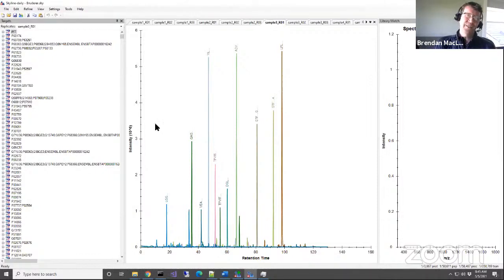And we got all the way through all the processing. We did a workflow that somebody might do with OpenSwath or some other tool that's not as visual as Skyline, and we got all the way through. We ran MSstats. The reports would be very similar to what you would get out of OpenSwath, but the nice thing is that we ended up with an artifact where we can go back and look at everything and double check how confident we feel about these results.